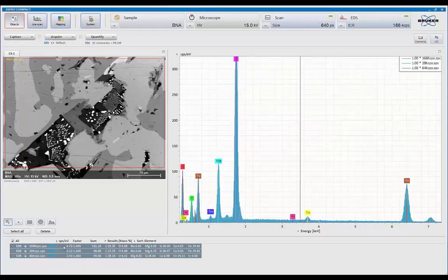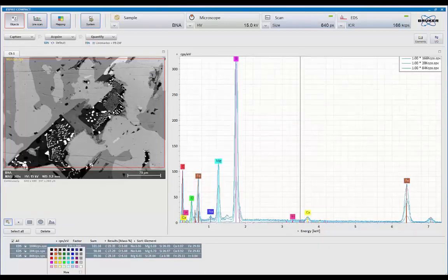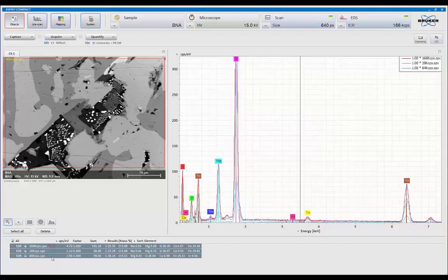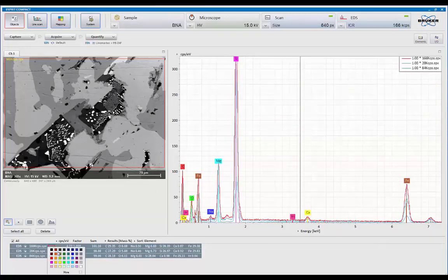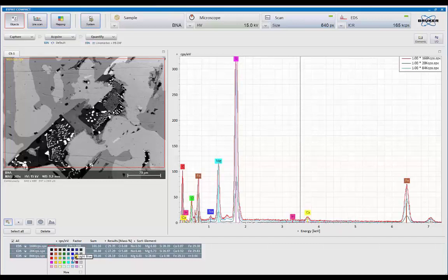And let me change the colors, switch them all to lines, choose a unique color for each one. So with that, I've got three spectrum overlaid.